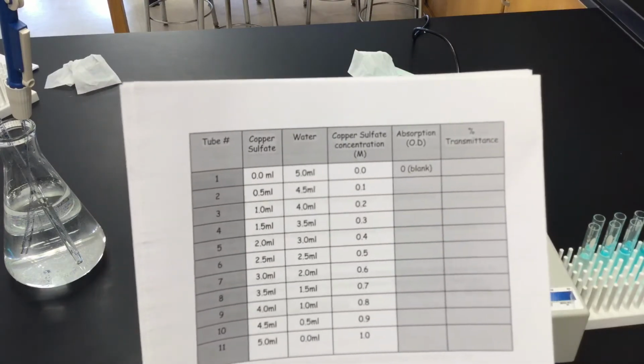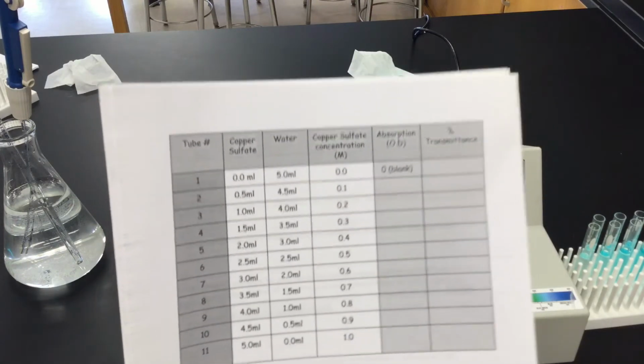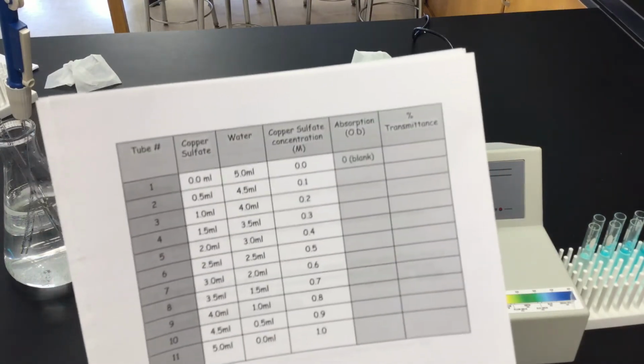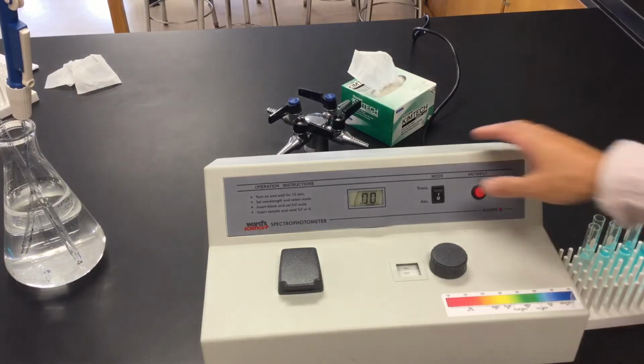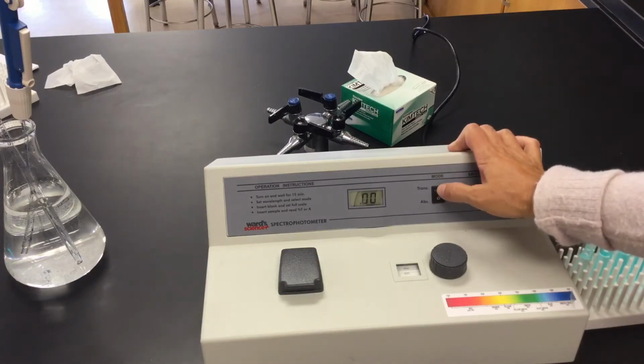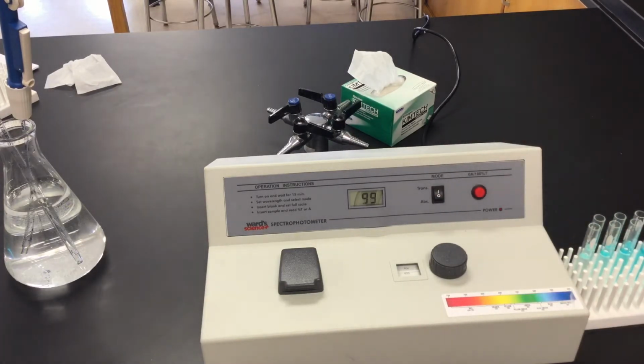Well, I know for water, my absorption should be absolutely 0. That's what's being absorbed. So if you think about it, if nothing is being absorbed, how much is actually being transmitted or passed through it? Well, if nothing's being absorbed, everything should be. My little toggle switch, all I'm going to do is flip it up, and it's at 99.